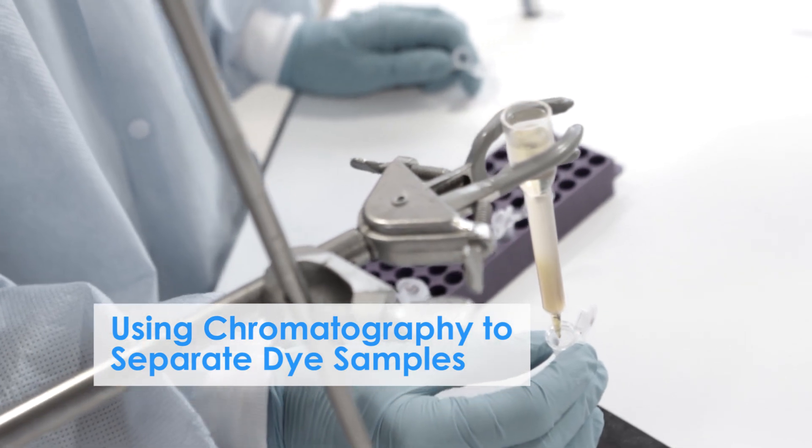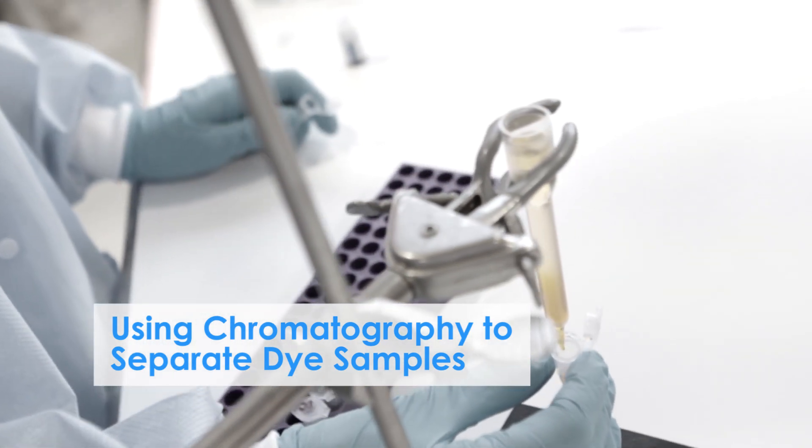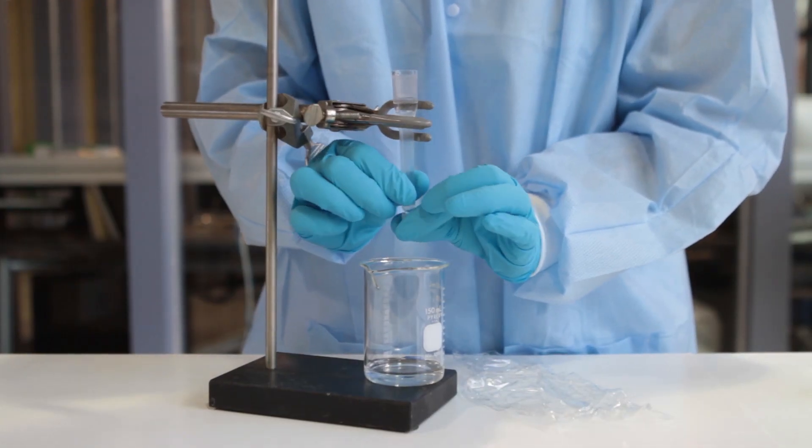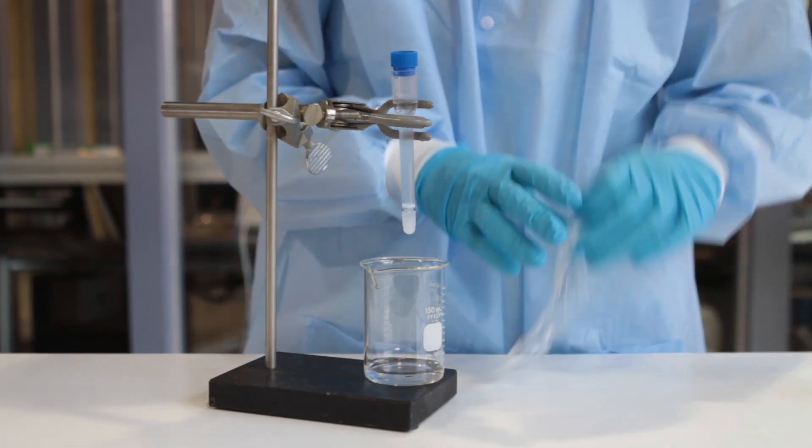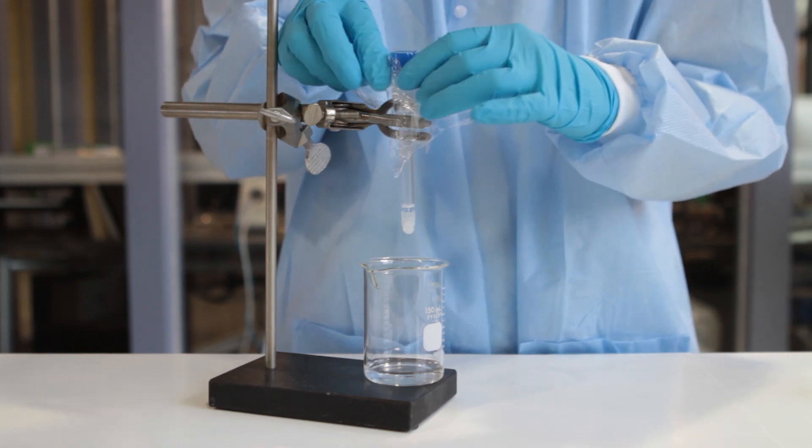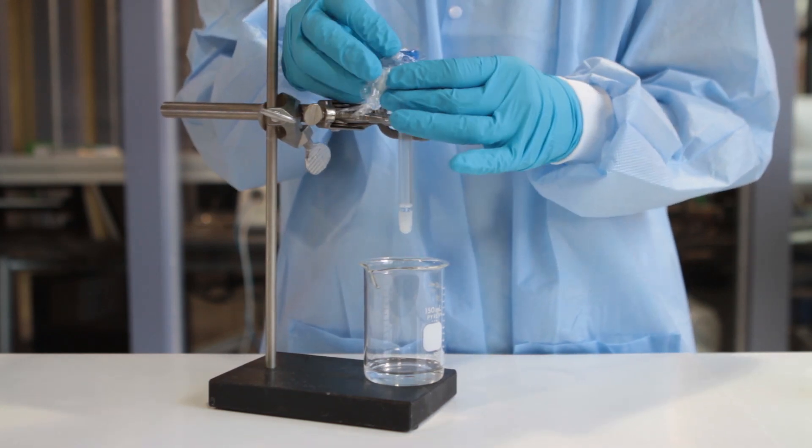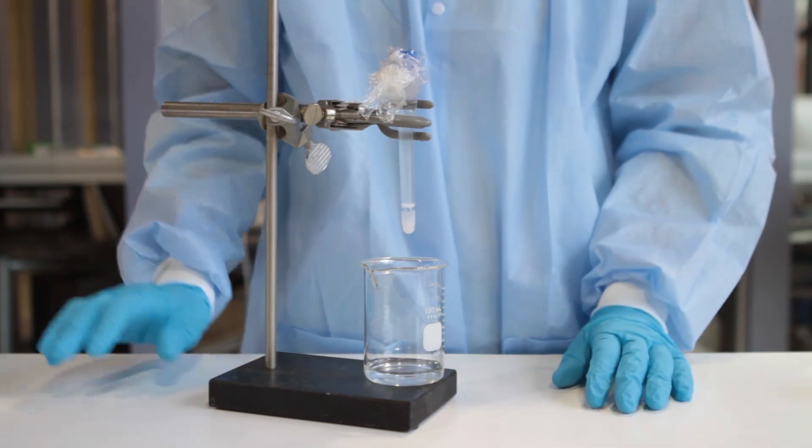The column must be securely capped so that the buffer does not leak out. Make sure there is buffer above the matrix bed before covering the reservoir with the cap or plastic wrap. Store the column in the refrigerator until needed.